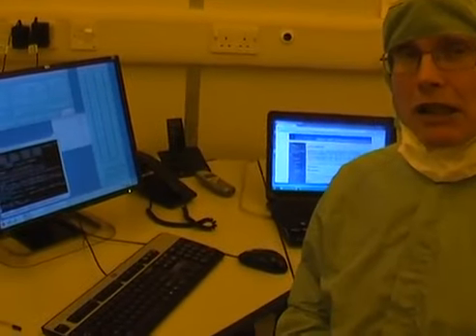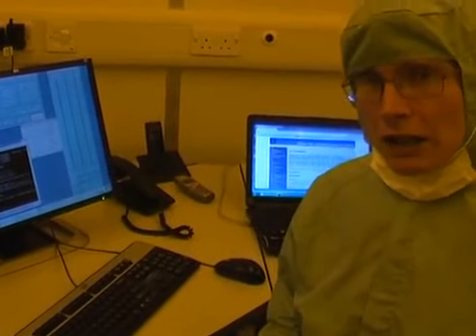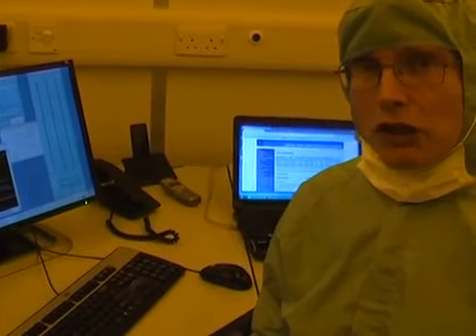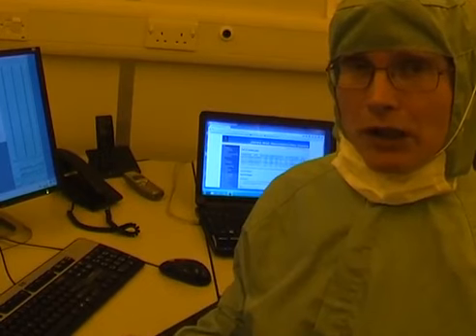If you remember the sample box and the labels on it, it's quite hard to label the sample box because the top surface is rough. But it's very important to write neatly on there because the operator needs to be able to identify your sample correctly with the list on the website. You'll also notice that the user writes some numbers on the back of the sample box to identify where it goes when the samples are loaded.